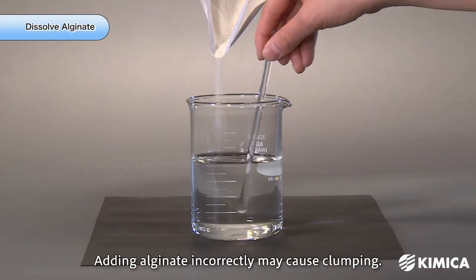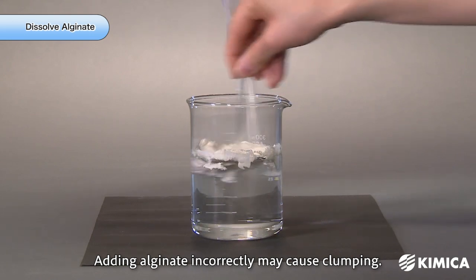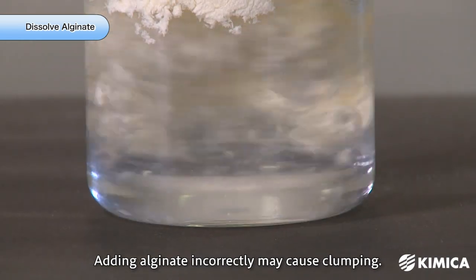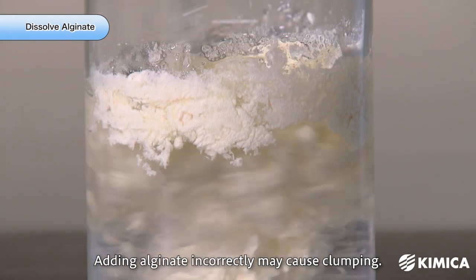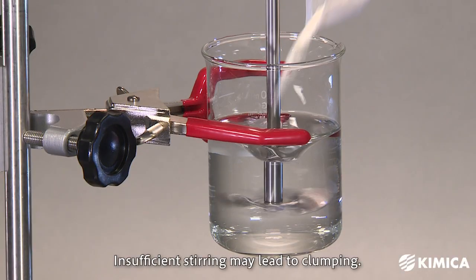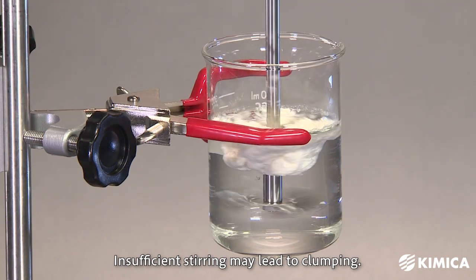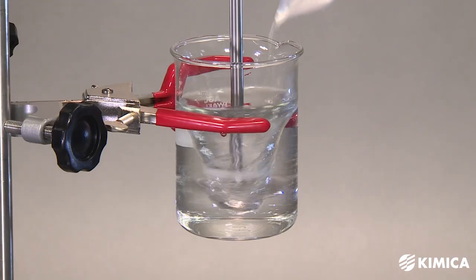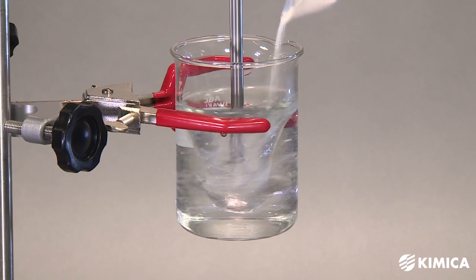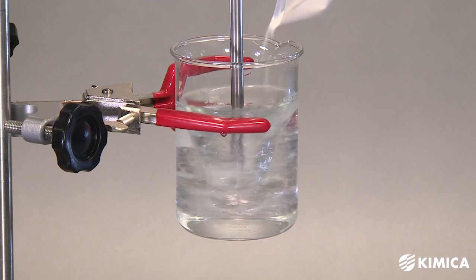Water-soluble polymers like alginate have a tendency to form clumps when introduced into water. If alginate powder is poured directly into water, it can form large clumps, resulting in a lengthy process to create a uniform water solution. Even when using a stirrer, inadequate agitation can also lead to the formation of clumps. To effectively dissolve alginate and make a uniform water solution in a short time, the key is dispersing alginate finely into the water to prevent the alginate powder from clumping.